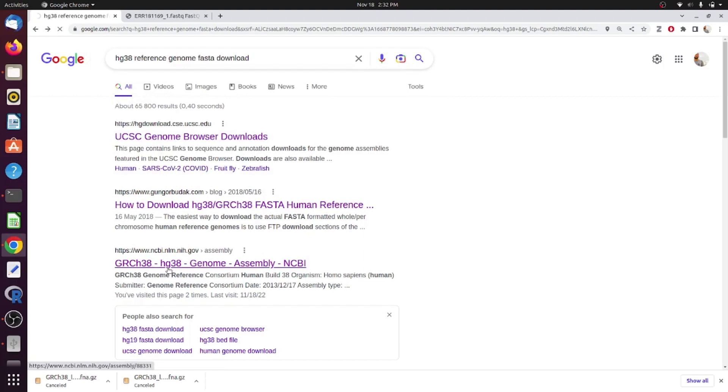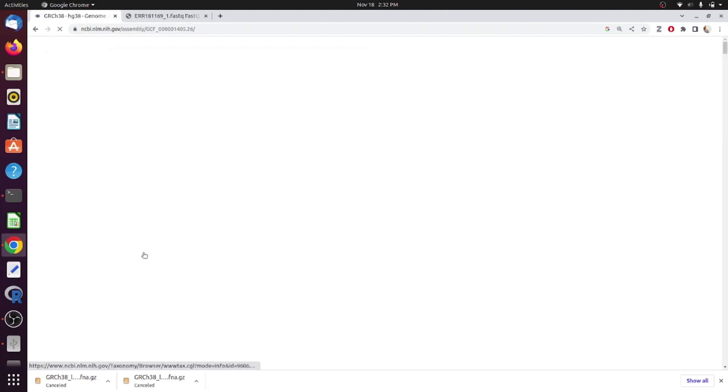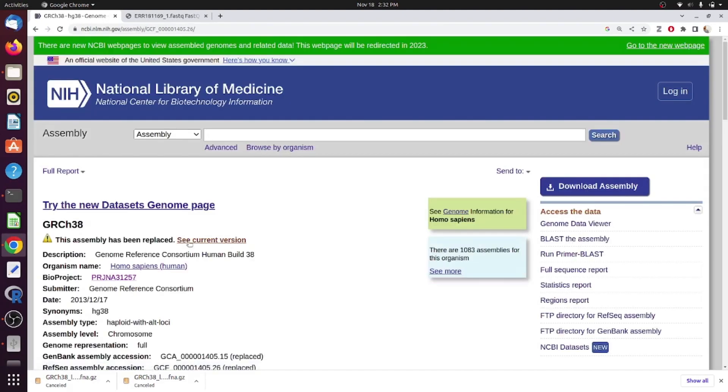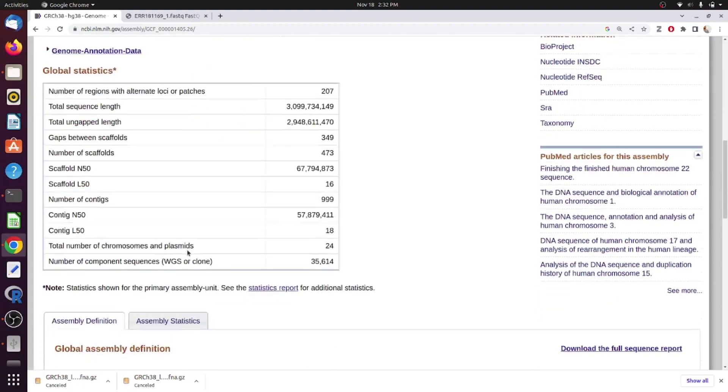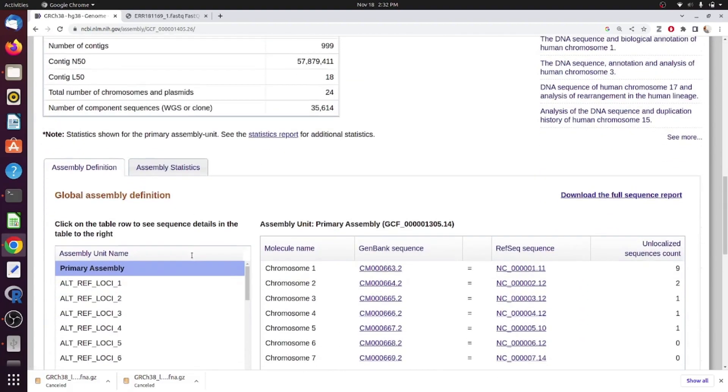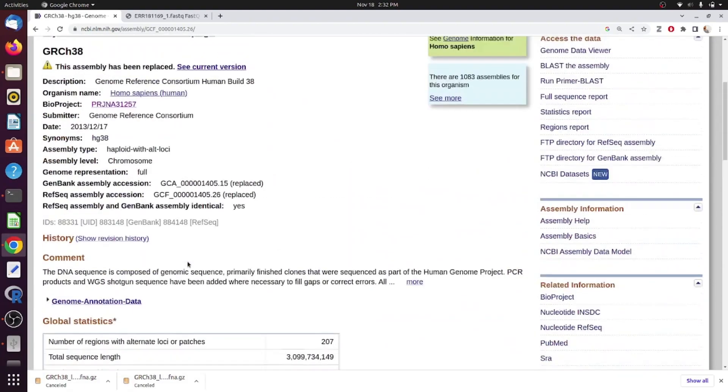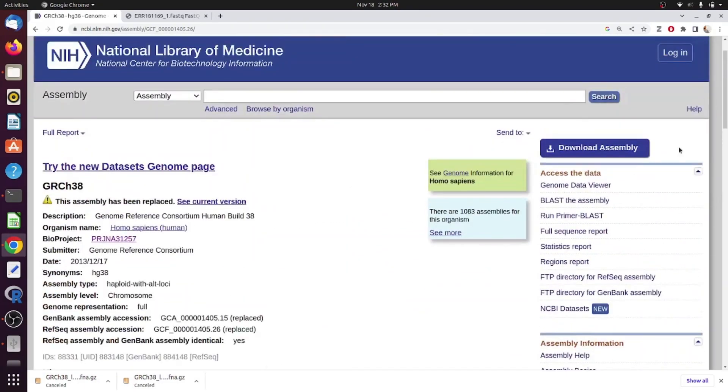From the search here I am going into NCBI website. You can see detailed information about the genome and also chromosome-wise information and sequences.